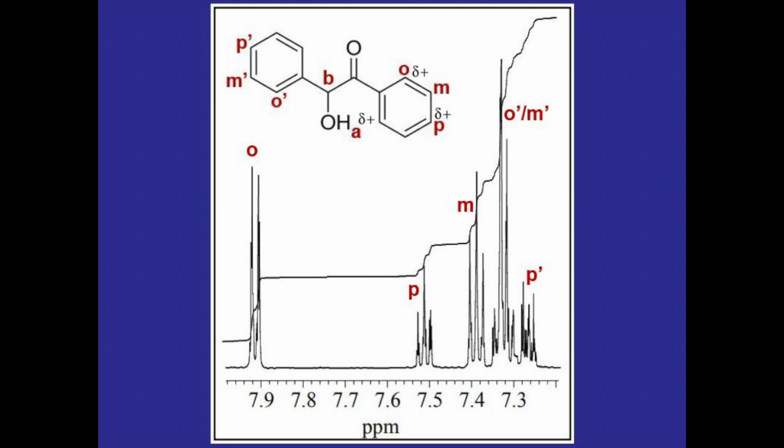And that's all I'm going to go over. I'm going to leave the rest for you now, but there's a little introduction to a different kind of 2D NMR.